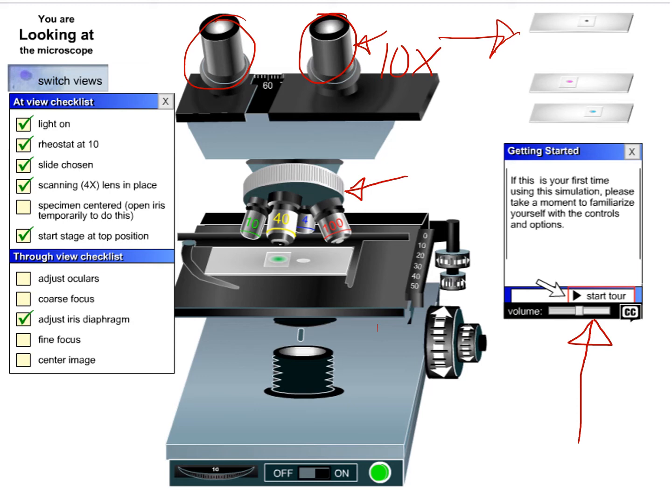Looking at the bottom of the microscope, this is the base. Firstly, you've got to turn it on. Secondly, there is this knob here. It's called the rheostat, and it adjusts how much light is going to come through the microscope. It turns more and less light on. The light comes out of the light source here. Then there is this fellow right here called the diaphragm, and it basically lets more or less light up from the light source onto the actual microscope slide there. So you can adjust that left and right, and it'll bring more and less light in. You'll have to experiment with what the effects of that are.